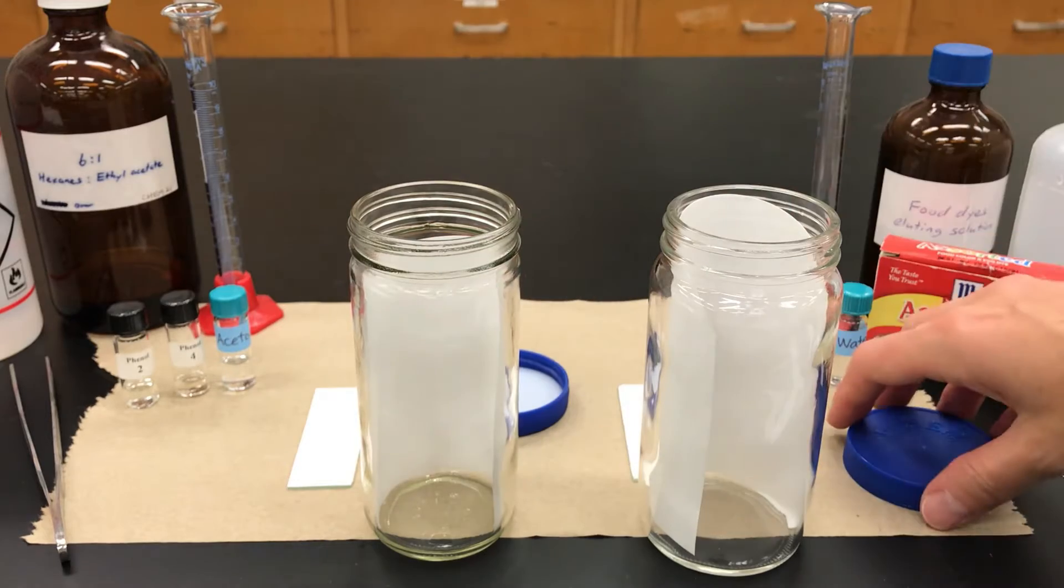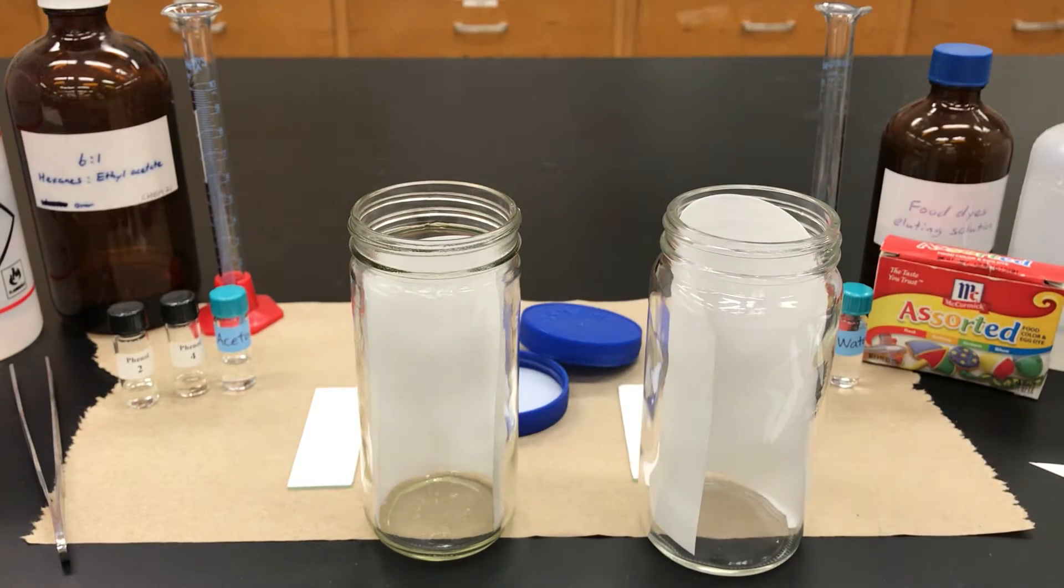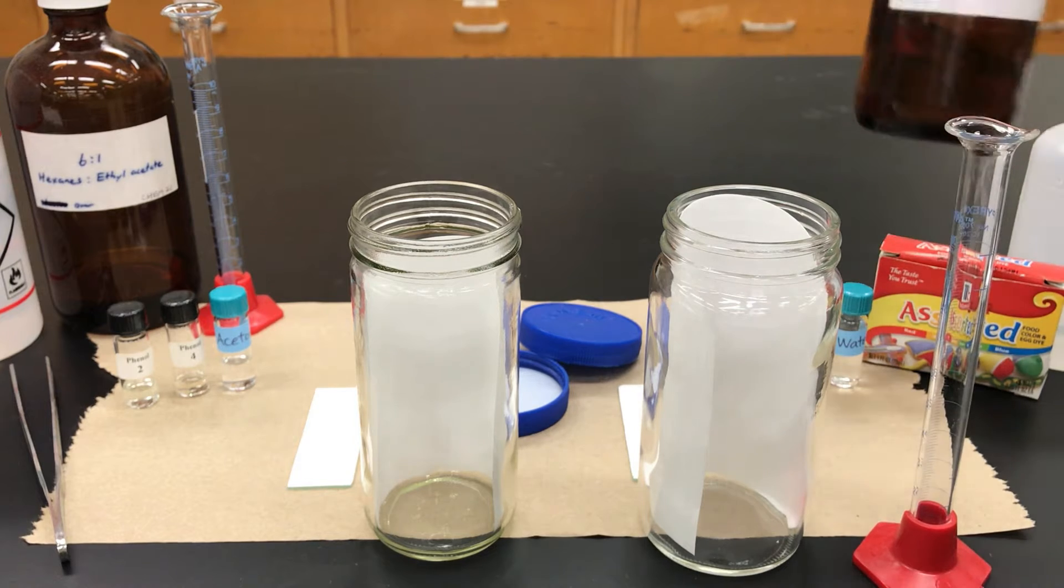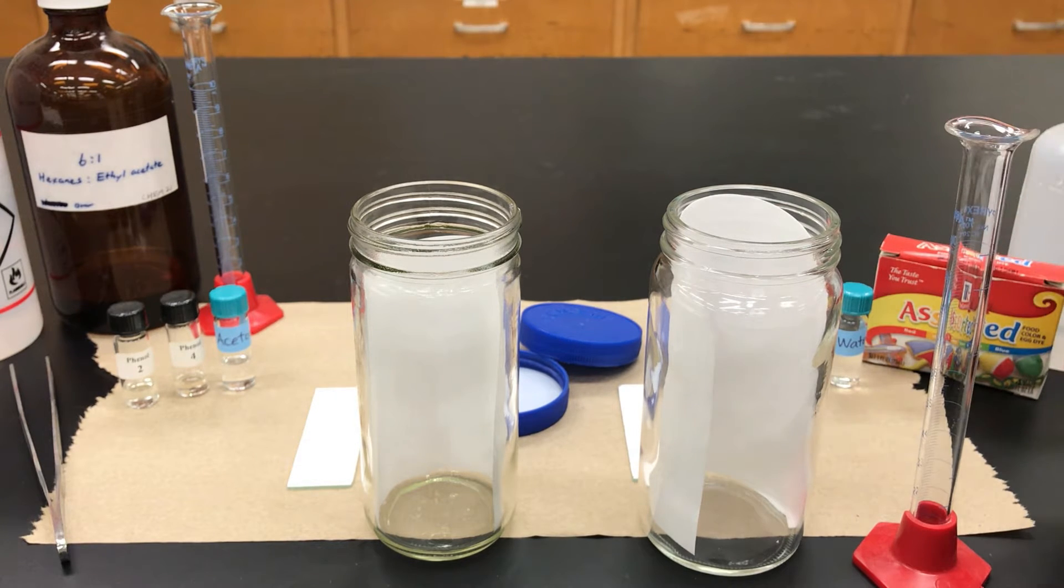Now I'm going to stick some liquid into these jars. So for the food dyes, I have a special mixture that's got some alcohols in it, a bit of ammonia, and I'm going to measure out 10 milliliters. It really depends on the size of your TLC jar.